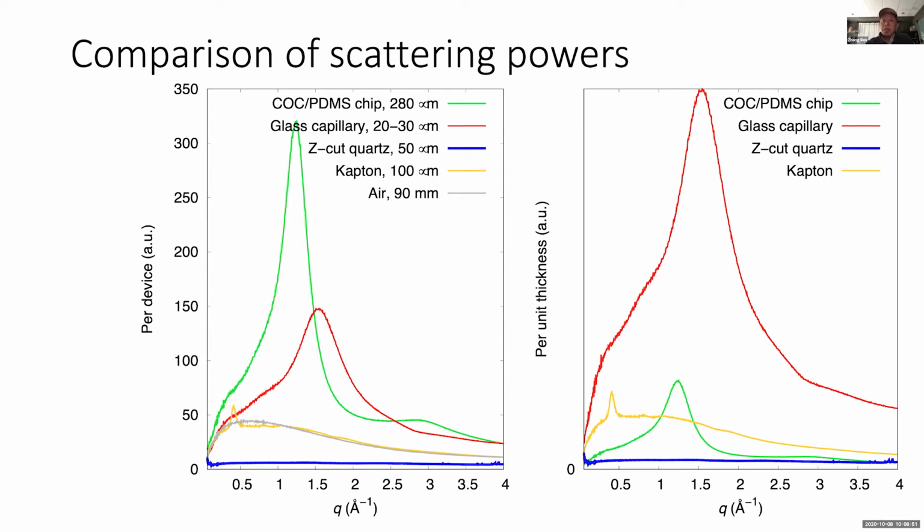It's literally a single crystal. Other than this very ordered material of single crystal, there is no disordered material in it. There's no solvent in any of these. So it does not scatter X-ray. And also you can avoid the Bragg scattering.